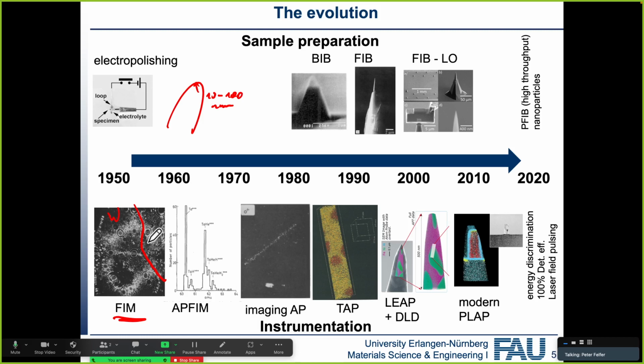So when people looked at grain boundaries in field ion microscopy for the first time, they noticed that they look the same after every however many atomic distances between them. And this was the idea behind the coincident site lattice. They said, okay, if I have two lattices like a Moiré pattern, they will have repeat units to them as well, and this is exactly what you see here.